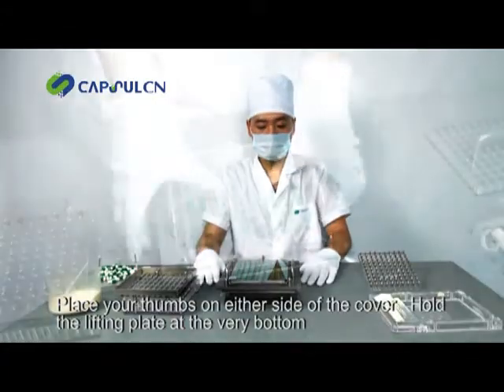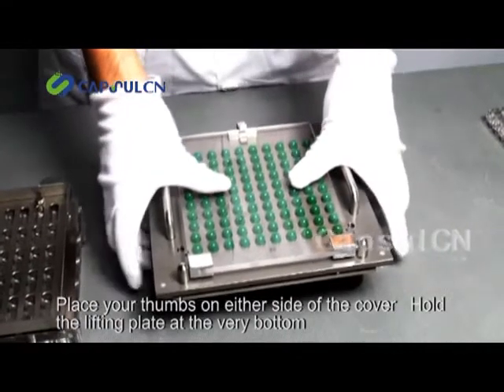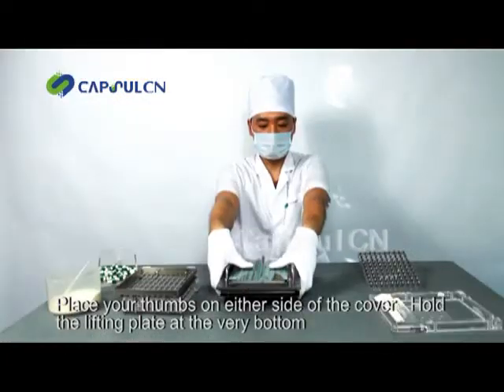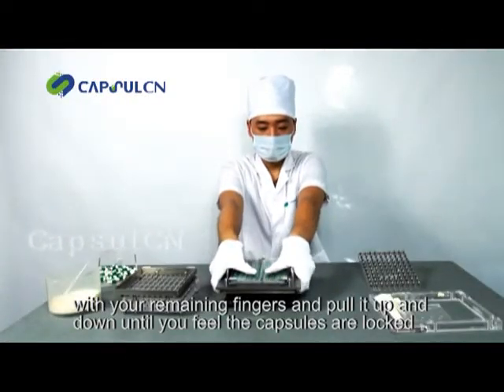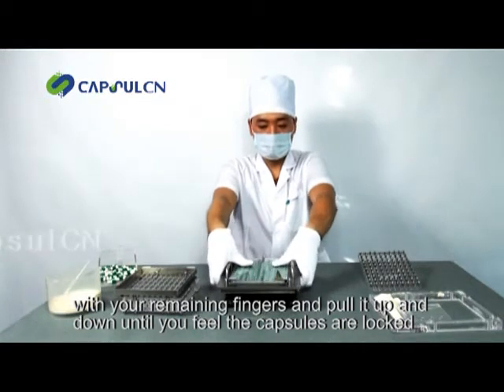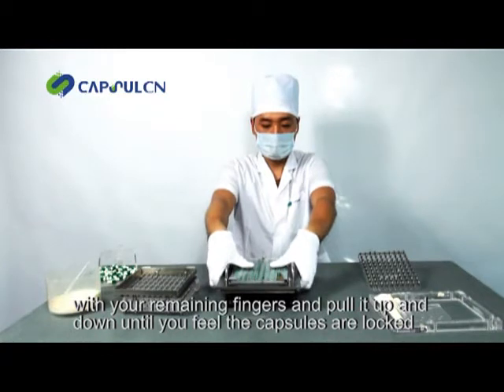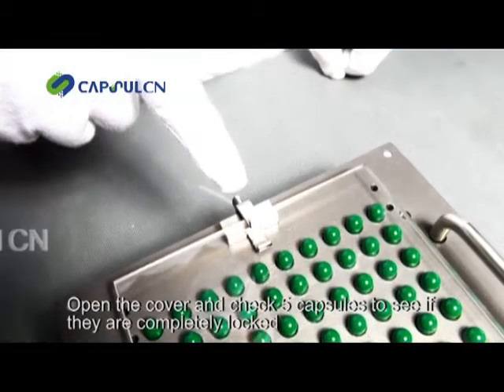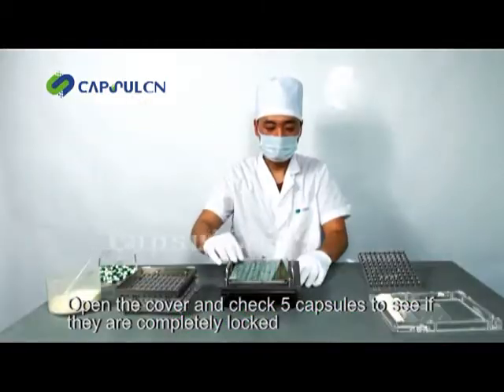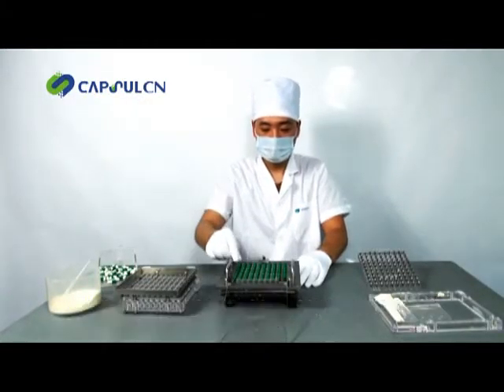Place your thumbs on either side of the cover. Hold the lifting plate at the very bottom with your remaining fingers and pull it up and down until you feel the capsules are locked. Open the cover and check five capsules to see if they are completely locked.